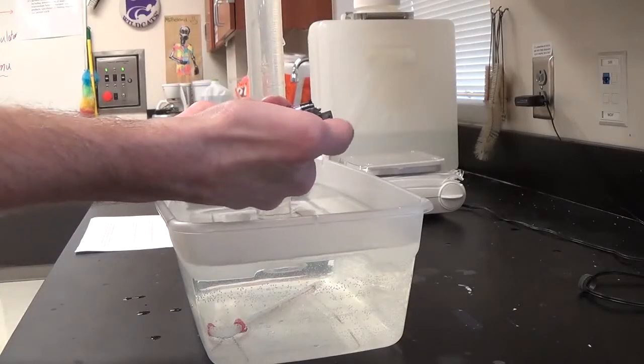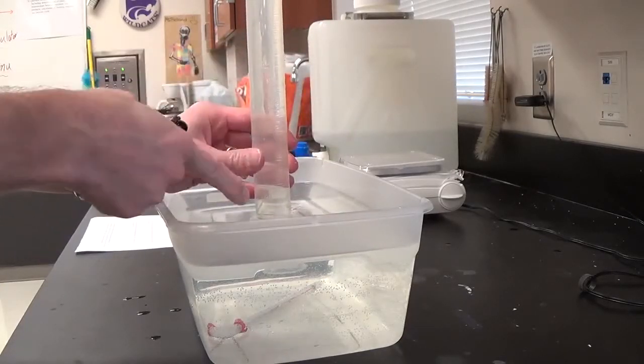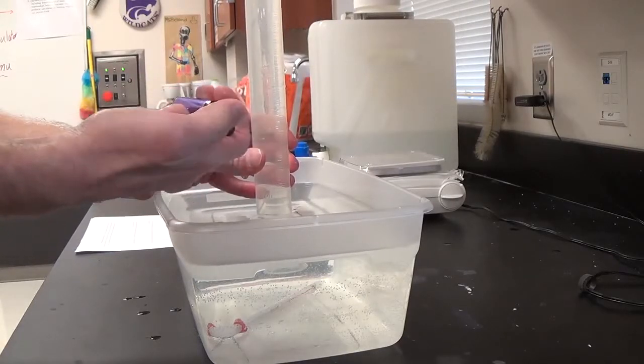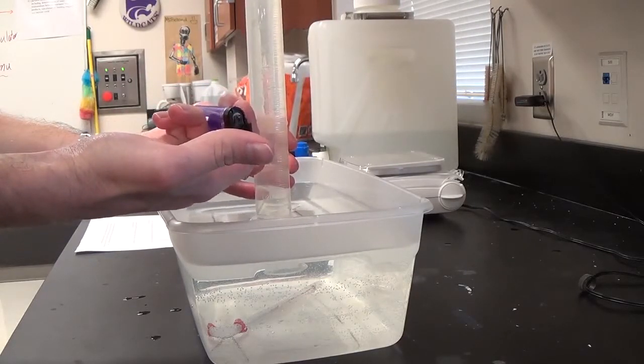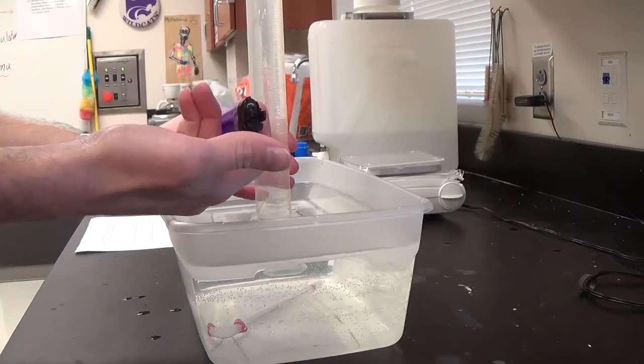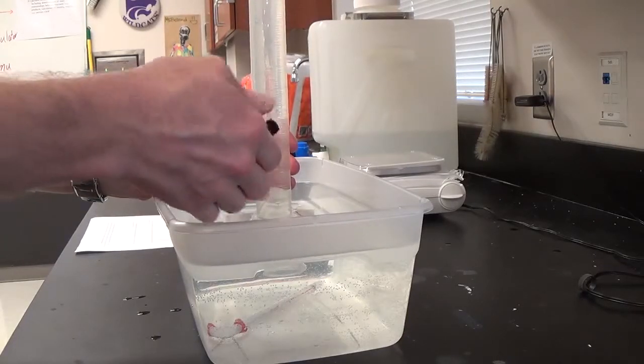Next you're going to put the lighter underneath so that when the bubbles come out, they'll be trapped in the graduated cylinder. When they come out of the lighter, you want to catch all of the gas, so don't push the button before you put it in the water.